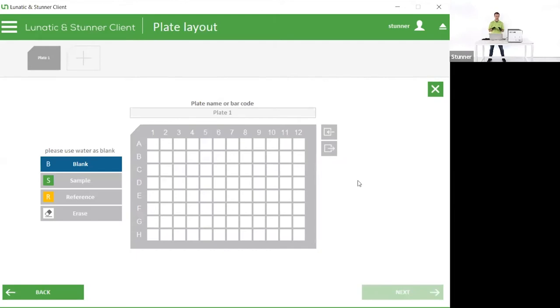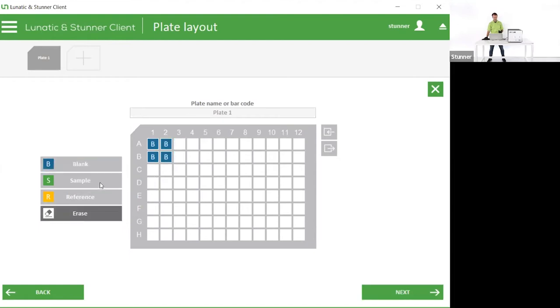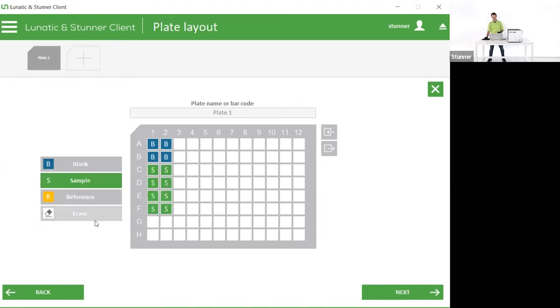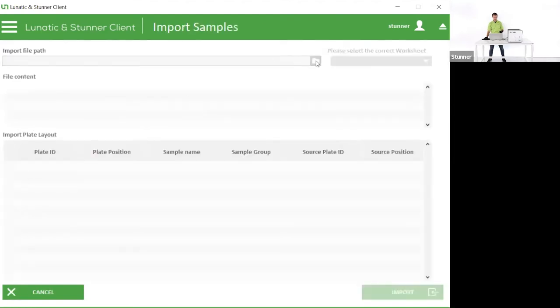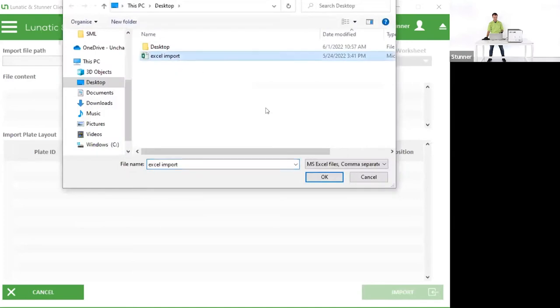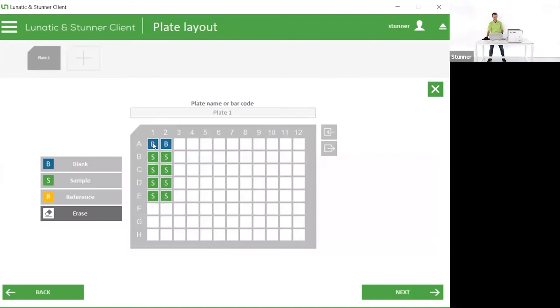Now comes the really cool part. This is where you define where the samples are on your plate. It's just a very nice click-and-drag paint type of interface. But if you wanted to do something a little bit faster, we can actually go and import from an Excel with just a couple of clicks. So I'm going to go ahead and do that with a quick Excel import. We'll see that the sample layouts just loaded in there with two blanks, two AAV samples - AAV5 and AAV9 - loaded in quadruplicates.